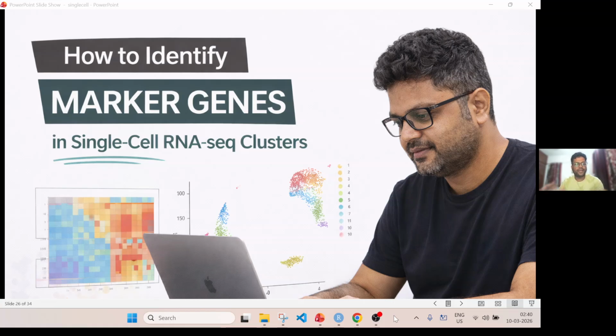Hi everyone. In this video, we will explore how to identify marker genes of single cell clusters. In the past video, we took the single cell dataset and clustered it, and then visualized it using PCA or t-SNE and UMAP. We talked about which method to use when.